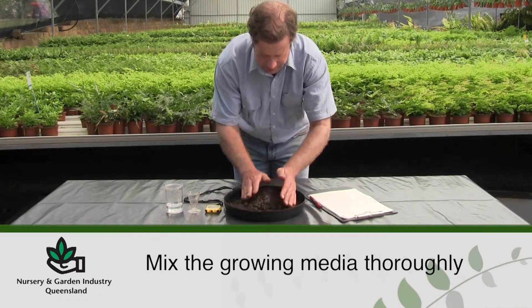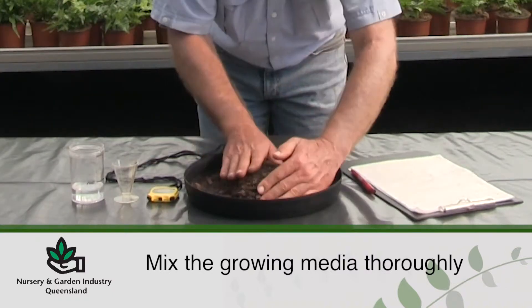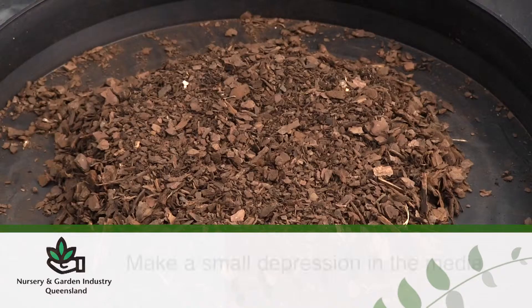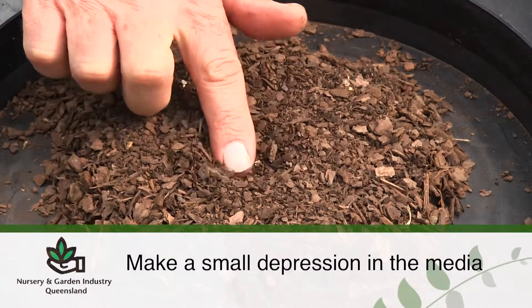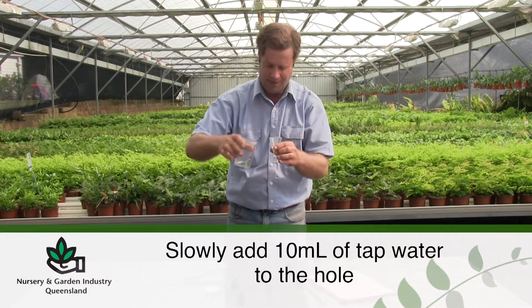Start with a pile of dry media and mix thoroughly. Flatten the pile to approximately 30 millimetres. Make a small depression in the media. Take 10 millilitres of tap water and add slowly to the depression.